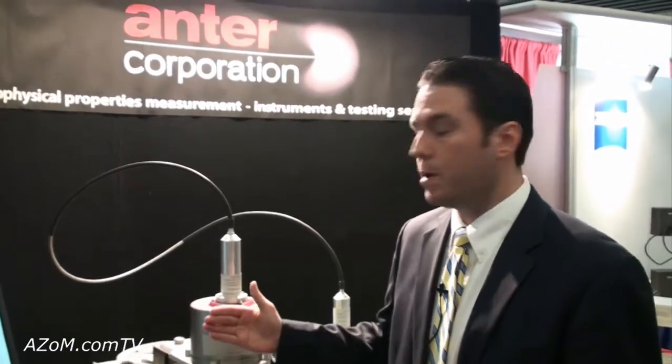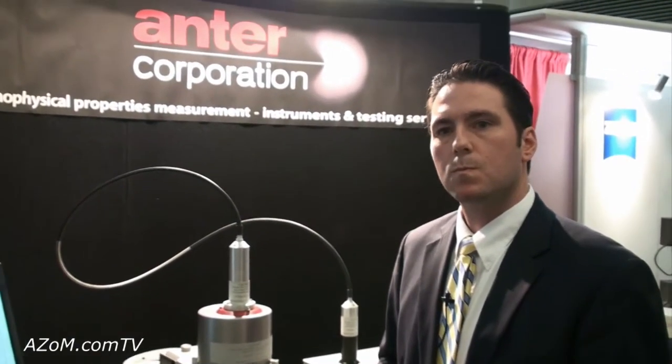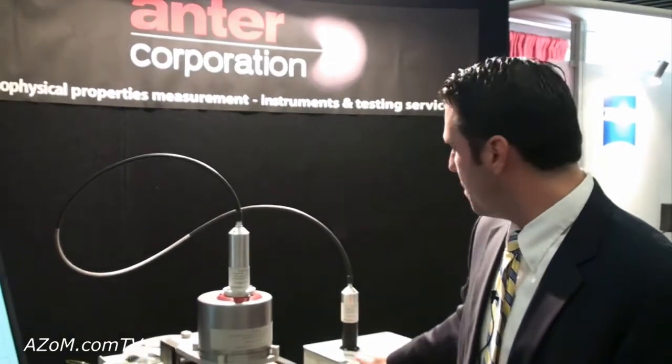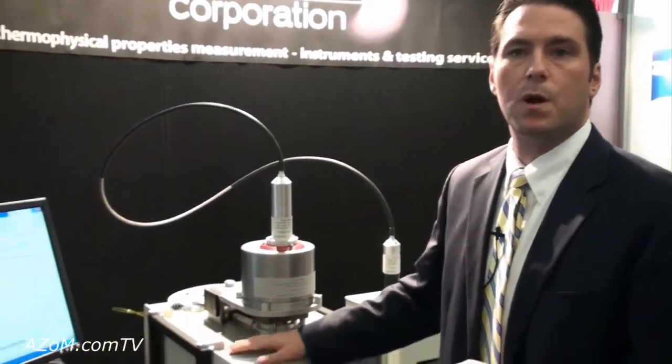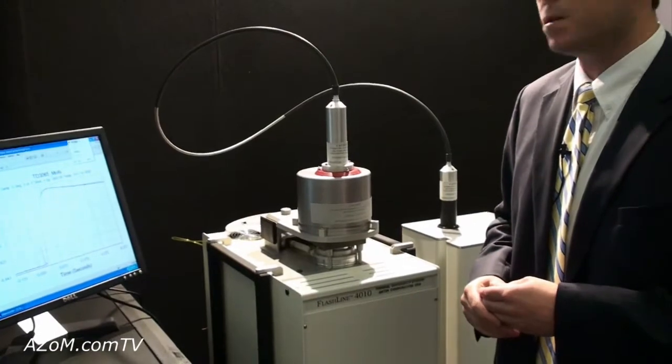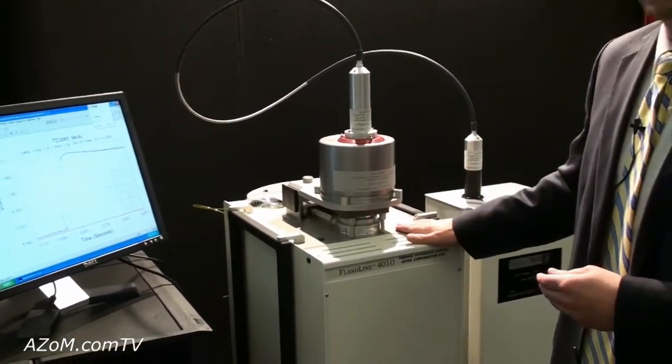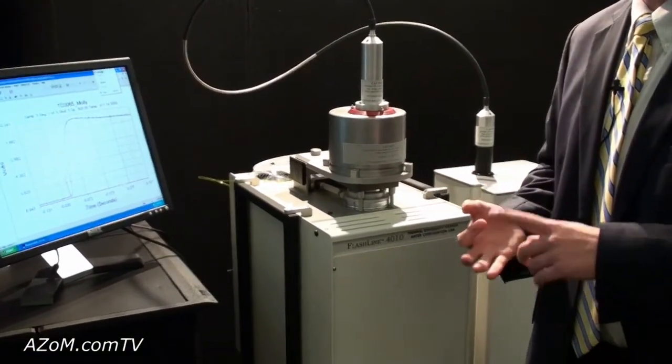If you're going at 100 degree intervals up to 1600, it might take six to eight hours. And what's the lowest temperature it can work at? This particular unit is room temp to 1600. With the laser module, we do have a unit that will go sub-ambient to minus 150 C. We also have a larger furnace that will go to 2800 degrees Celsius, six sample furnace as well. This is just an alumina furnace model that can operate in air or inert gas or under high vac.